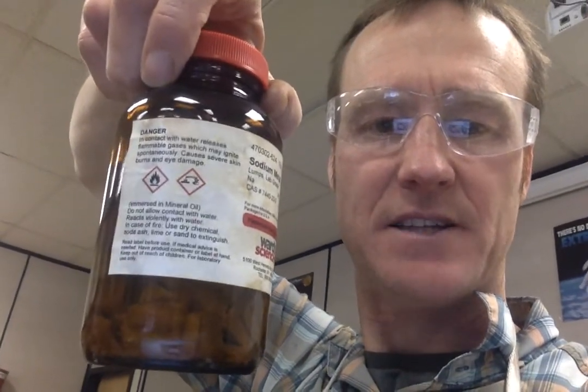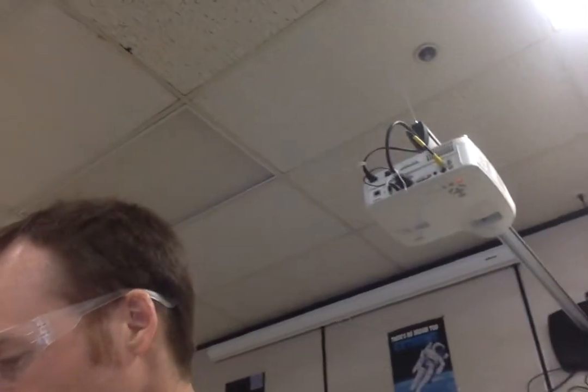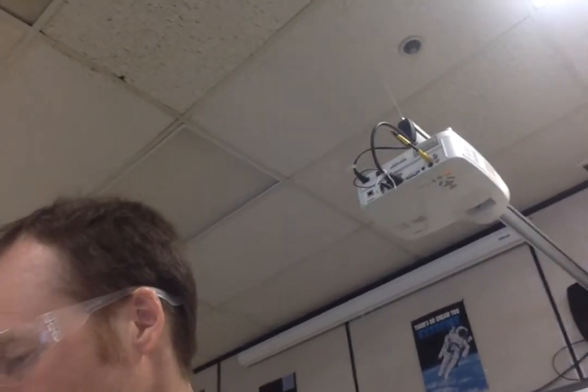Notice with the sodium, the hazard symbols on this. It's flammable and it's corrosive. I would never have you guys use it on your own because it makes a solution that's pretty much like Drano that'll eat away at your skin. I'm actually going to have to, it's going to be a little tricky, while we're going outside.